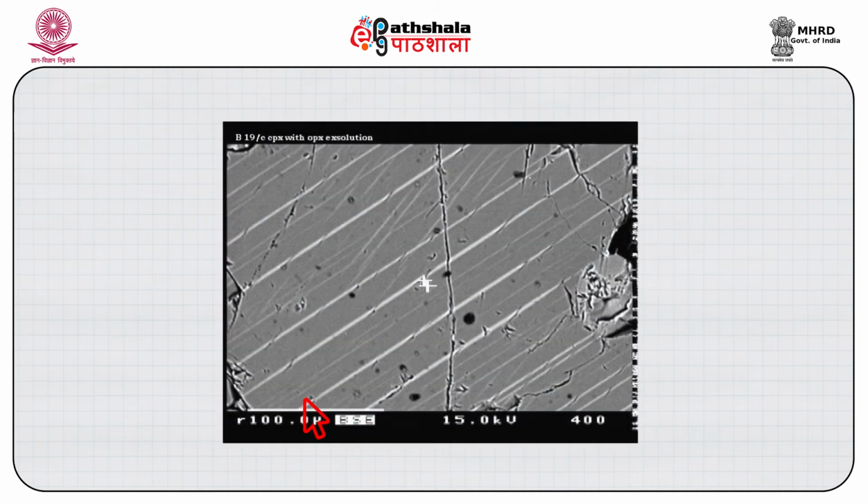In this figure, which is typical of an igneous texture, we have exsolution of pyroxenes within pyroxene, and again the backscattered electron image allows us to distinguish not only one crystallographic layer along which the exsolutions have taken place, but at an angle there is a fainter shade which is distinguishing two different events of exsolution.